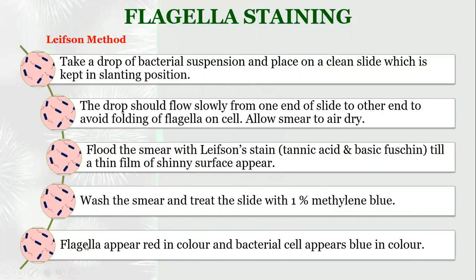Then once you observe under the microscope, the flagella of the bacteria appear as red color and the bacteria appear as blue color. Here in these images, you can see the bacteria appear blue and the flagella appear pink.